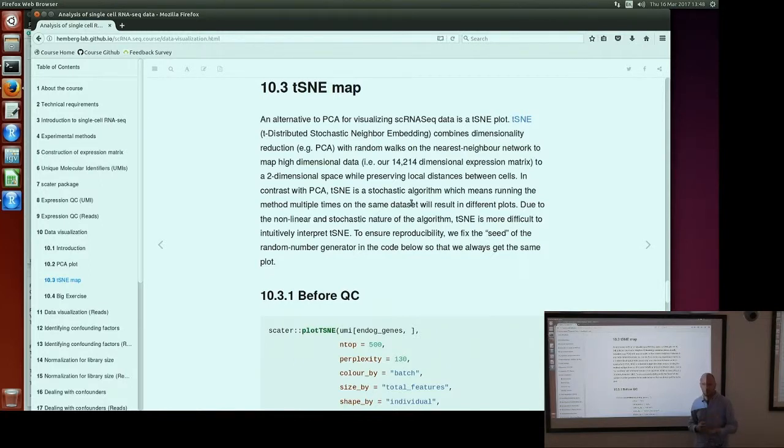So for example, if you look at single cell papers recently published, there are lots of t-SNE plots. But what happens is usually people find the clusters before plotting the t-SNE, right? So then they know what groups they have in the data, and then they run t-SNE in a way that it represents the groups, and then they color code the groups on the t-SNE plot. So they don't use t-SNE for clustering. They use it only for representation of the data.